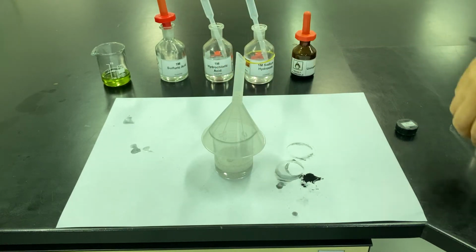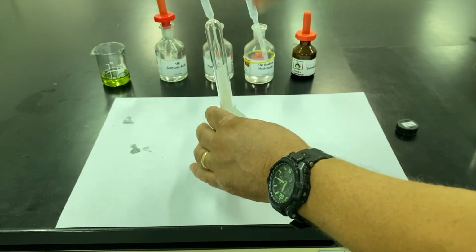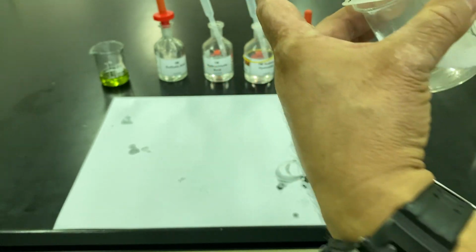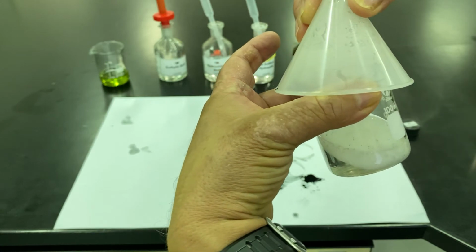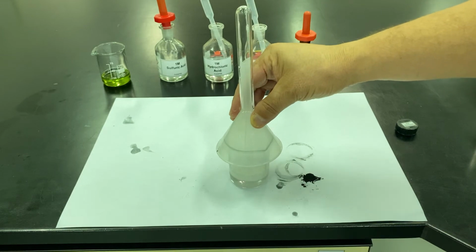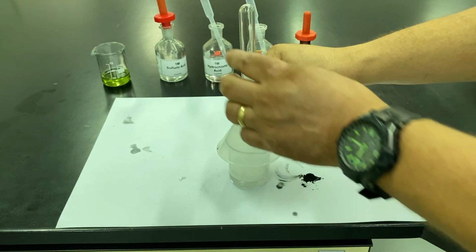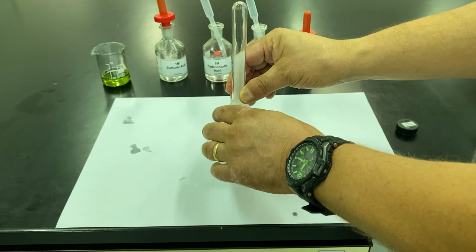Right, let's collect that hydrogen gas. Like so. So as you can see, now there's a lot of heat being given off as well, but as we can see it's bubbling away, and I'm collecting the hydrogen gas in the test tube. Okay, so that's quite hot. It's bubbling away and producing hydrogen gas. The hydrogen gas is being collected in the test tube.